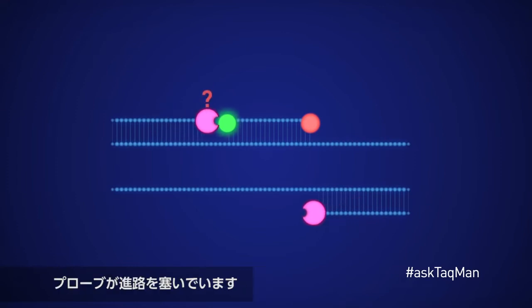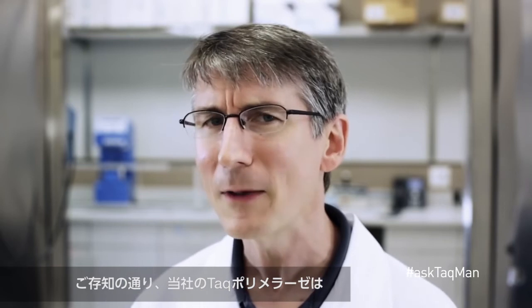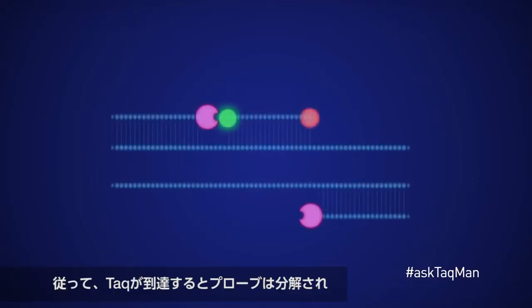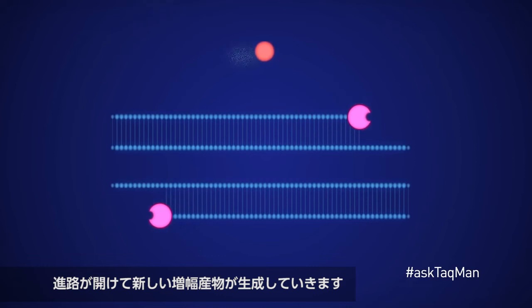But wait — there's a probe sitting in the way. It's a showdown in the making. What will the polymerase do? Stop in its tracks? Turn back in fear? Not Taq polymerase. You see, our enzyme has what's referred to as exonuclease activity, meaning it pretty much eats DNA for lunch. So when Taq reaches the probe, it simply chews it to bits on its way to creating new amplicon.